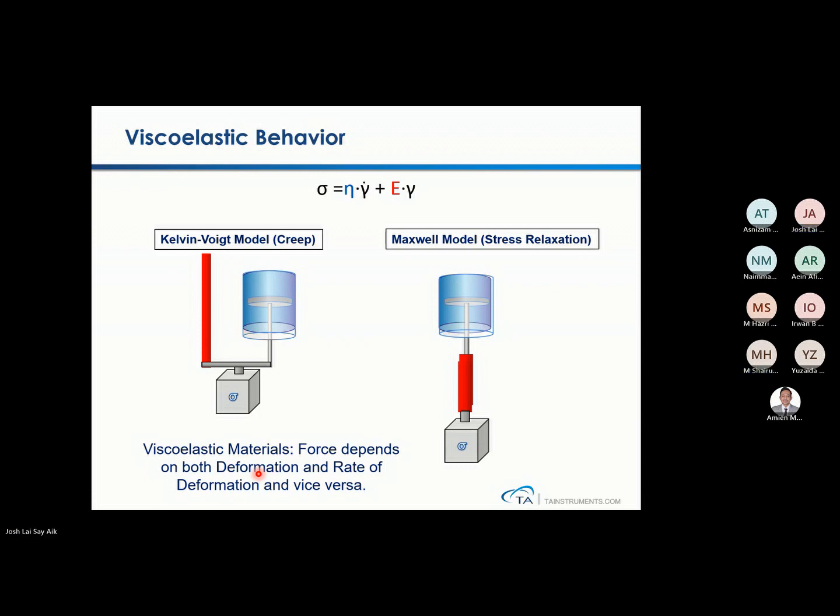Meaning that the resistance to the changes or displacement, it will separate for you. It's actually due to the resistance to flow or the cohesiveness of a solid material, which a tensile machine cannot tell you.